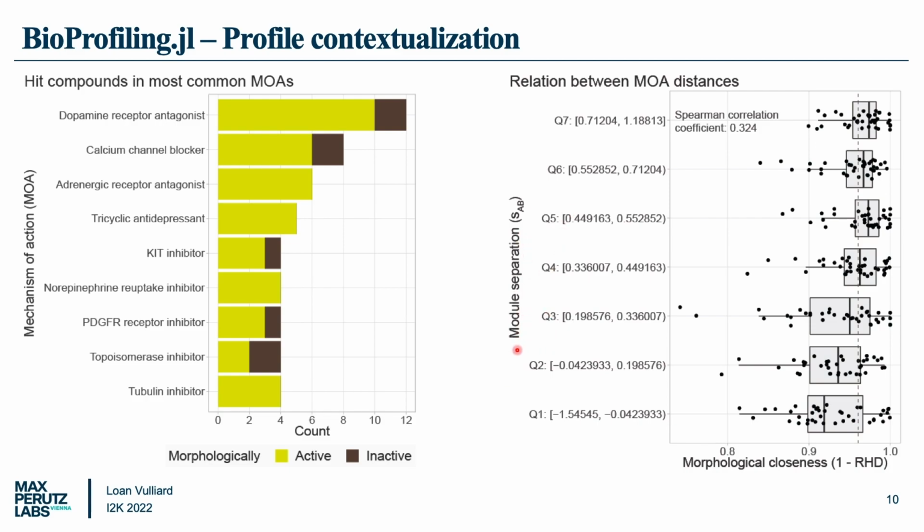So I just wanted to point out that there is some information that is overlapping between the different ways to look at our drugs, but the morphology in itself is bringing quite a complementary view of drug effectiveness.